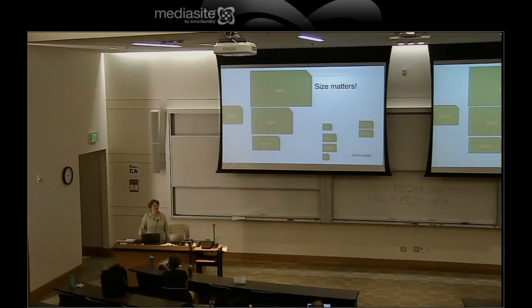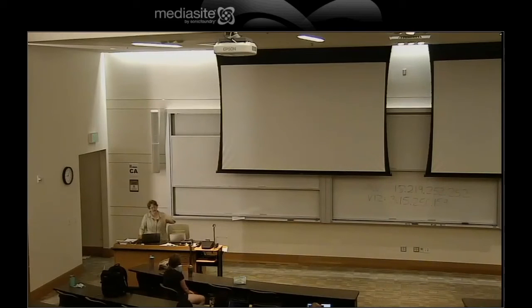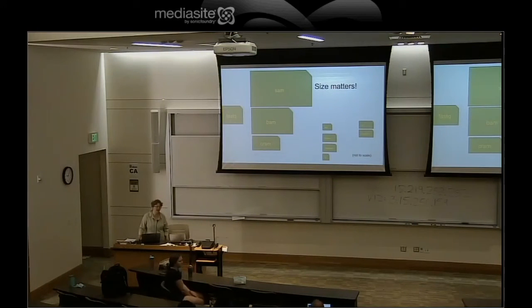And because every time you work on the supercomputer, everything you type has to be transmitted to the supercomputer and back again, it is sometimes worth it to not stay on the supercomputer. So some of what we're going to be doing today is in R on our own personal laptops. Once you get to a small format, like the count text file we're going to do today, then you can move it to your computer and work. And that is what we're trying to teach you: when is it okay to do it on your computer versus when do you have to do it on the supercomputer?